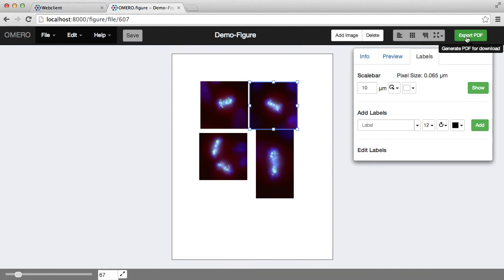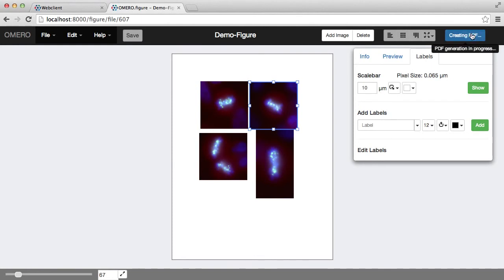And if I want to export it to PDF, I can do that using the button at the top right here.